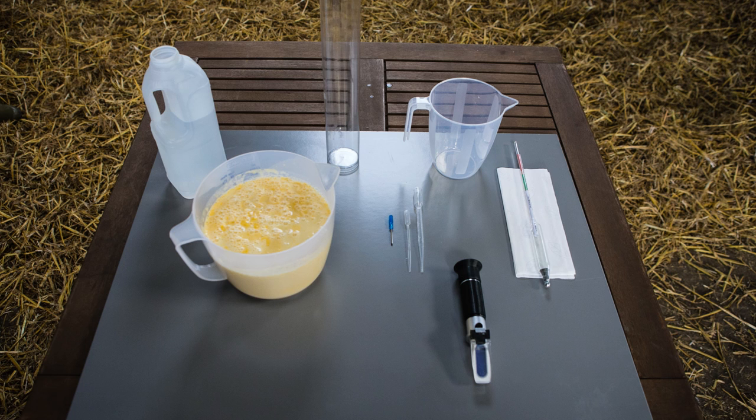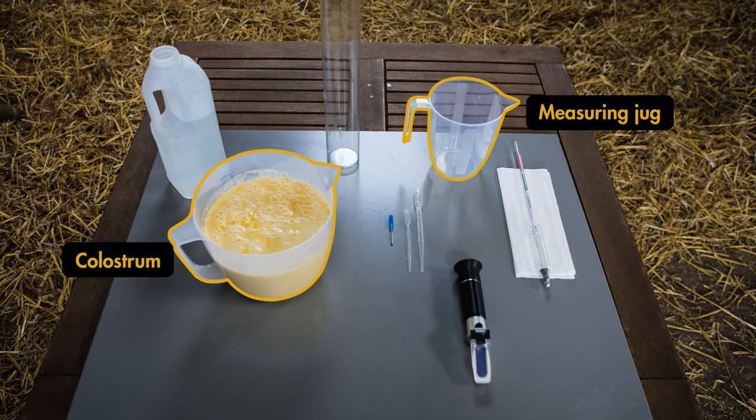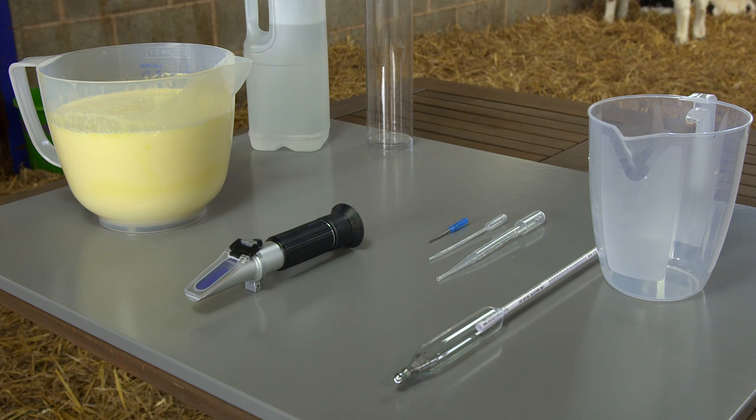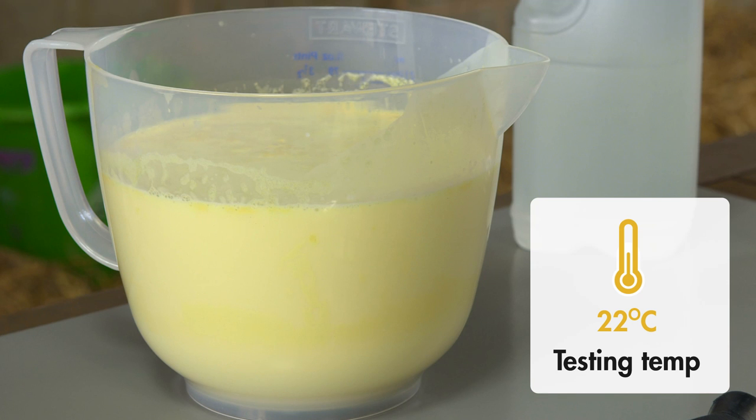To test for quality using a colostrometer, you'll need colostrum, which is cooled to room temperature, a very clean jug, clean enough to use in your kitchen, a clean measuring cylinder, and the clean colostrometer. When you're using the colostrometer, it's always important to use it at the same temperature. And so the colostrum should ideally be at a room temperature of 22 degrees Celsius.